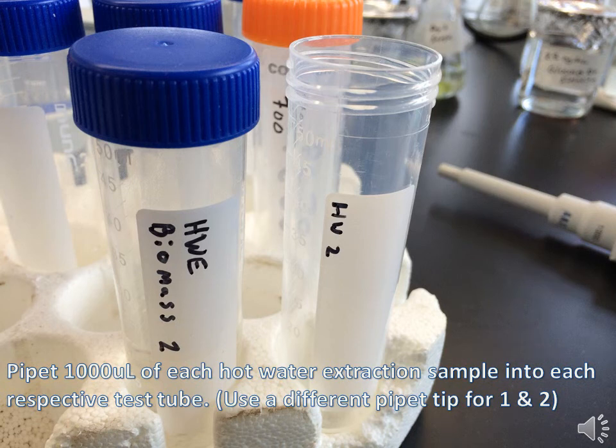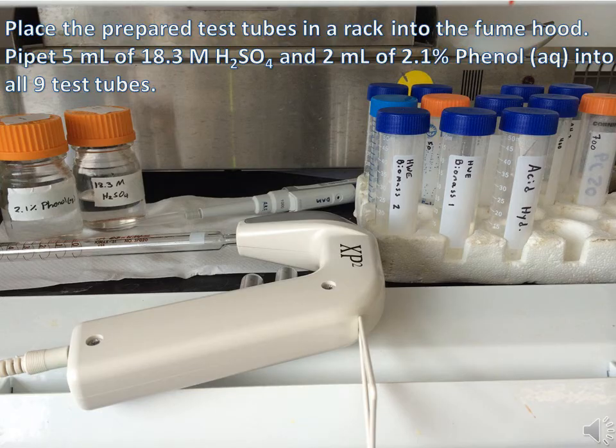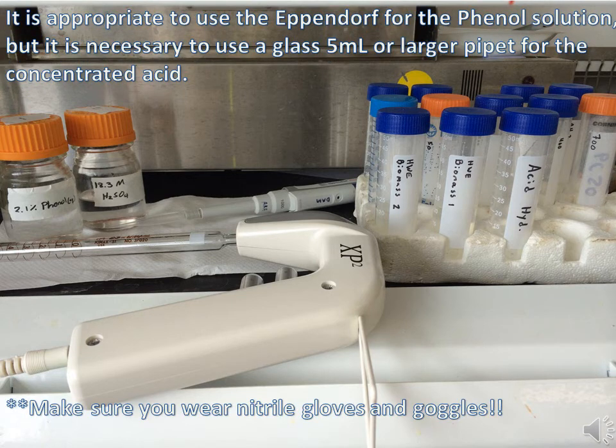Pipette 1000 microliters of each hot water extraction sample into the respective test tubes labeled HW1 and HW2. Prepare the acid hydrolysis samples in duplicate by following the table listed on this slide. Bring your test tube rack to the fume hood and pipette 5 milliliters of 18.3 molar sulfuric acid and 2 milliliters of 2.1% phenol into each test tube. When pipetting these solutions in the fume hood, make sure you're wearing both protective gloves and goggles.